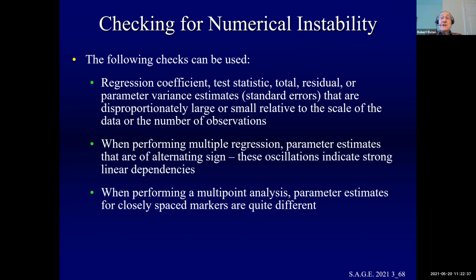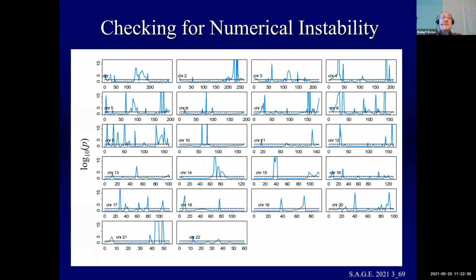Look at this picture and you can see there's a lot of instability. You can see lots of peaks relatively close together, and that is not the way it is. And you can see they're huge peaks. You can look at the scale of things, there you see the scale, 15. That's way out, way up there.